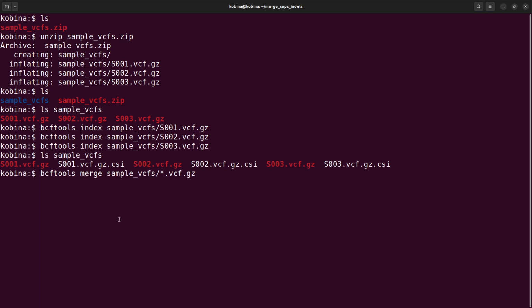Again, there are about 3 different approaches to specify input files when using bcftools merge. All right, so I have a separate tutorial on bcftools merge that gives all these approaches. In this tutorial, I'm giving just one approach. There are others as well, so take notes.